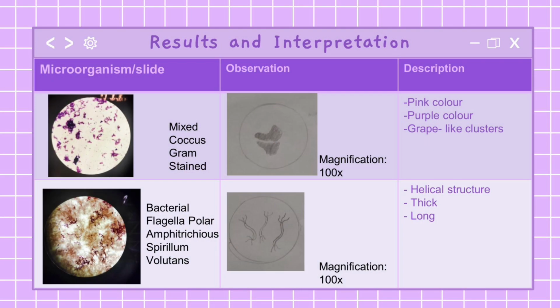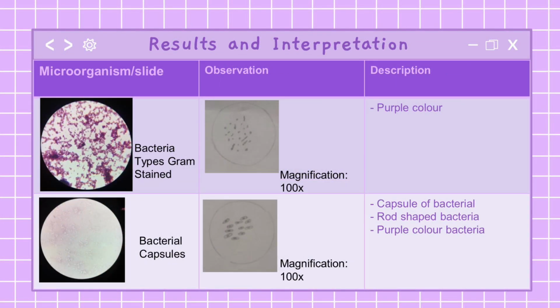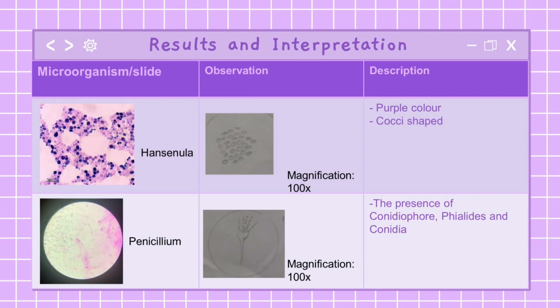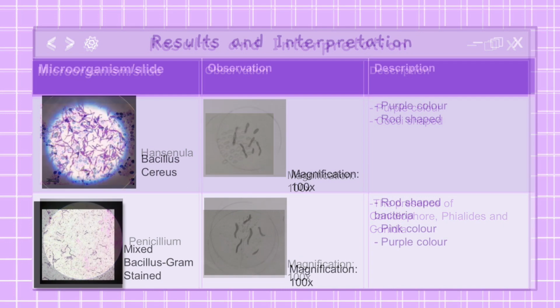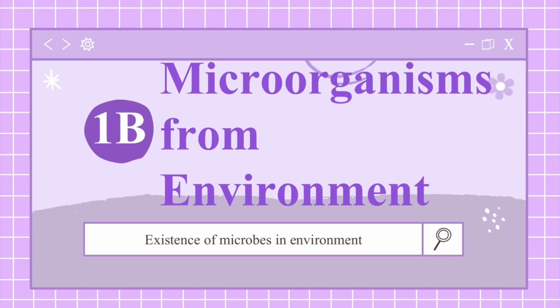And finally, here are the results and interpretation for the experiment. Off and the dust cover will be applied.